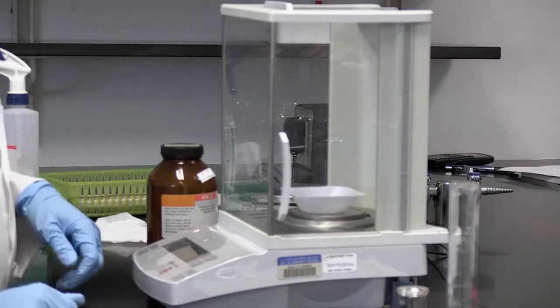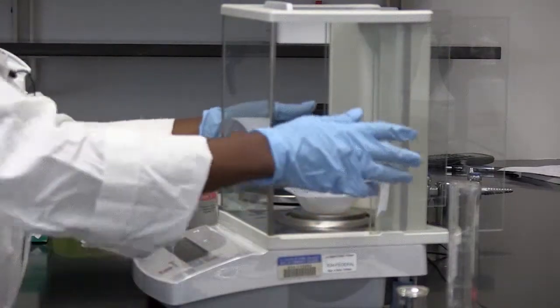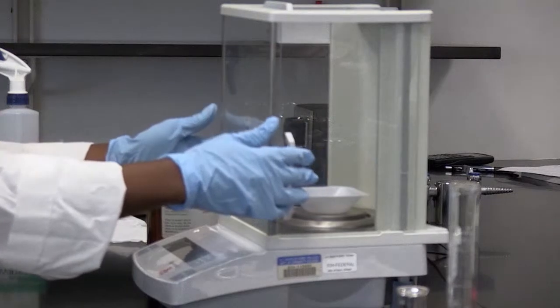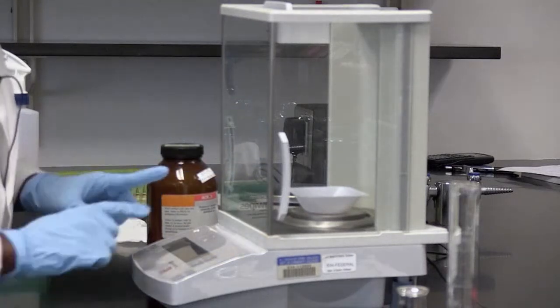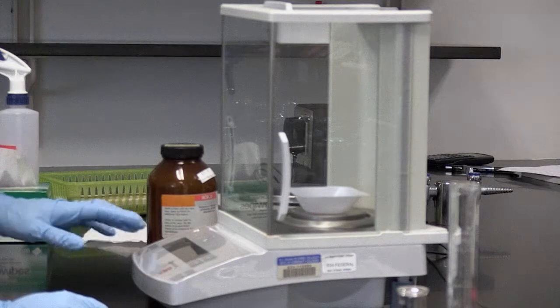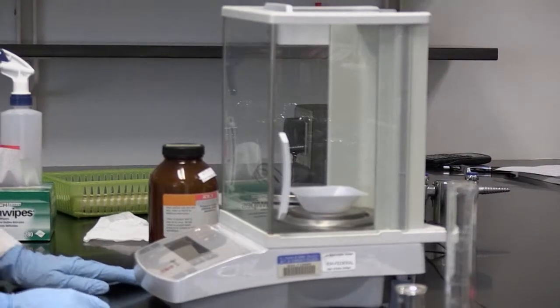The important thing to note here is that when you put your weigh boat on the pan to get it to the zero point, you have to make sure you close these doors, because that's the only way you're going to get the most accurate measurement. And when the screen shows an asterisk plus a gram symbol, then you know that the mass you see recorded is the correct one.